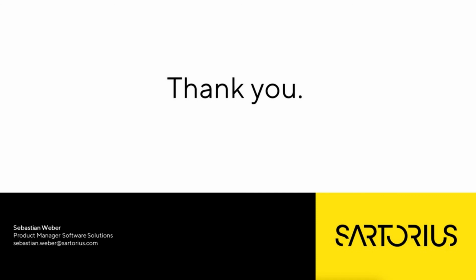Okay, so the balance uses the Cubis software, if you like. That's the balance software. This is where the user and application management is set up, so that's basically on the balance. And then depending on how you want to connect to the balance, a lot of people are using their own corporate Active Directory LDAP facility. This is in conjunction with the balance functionality to manage profiles and to set roles for various profiles. So essentially all of that functionality is on balance.